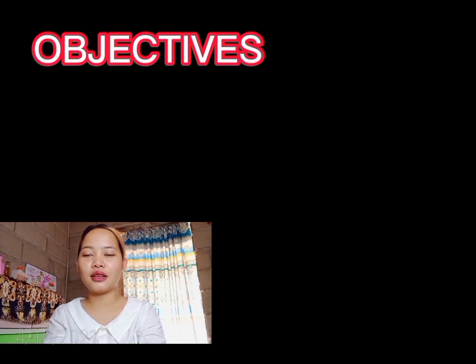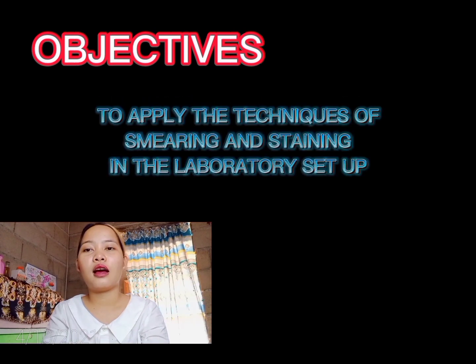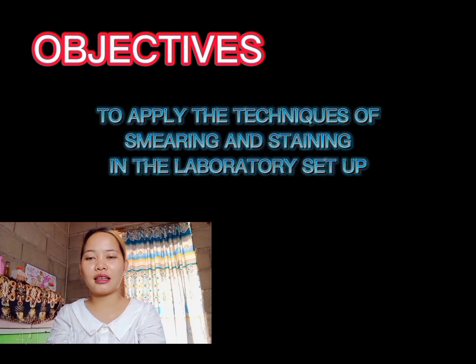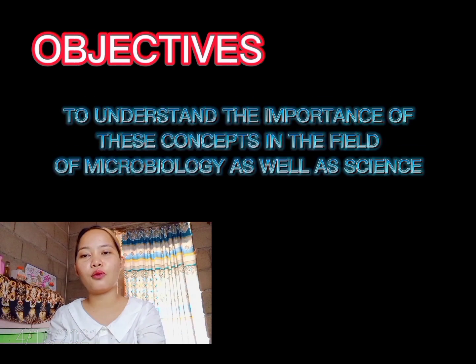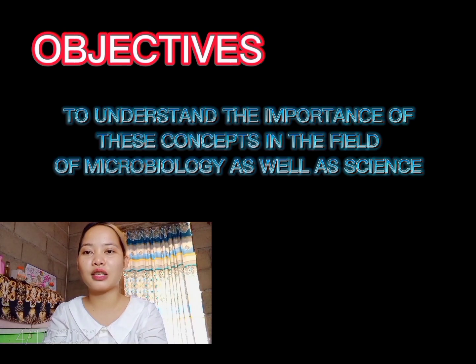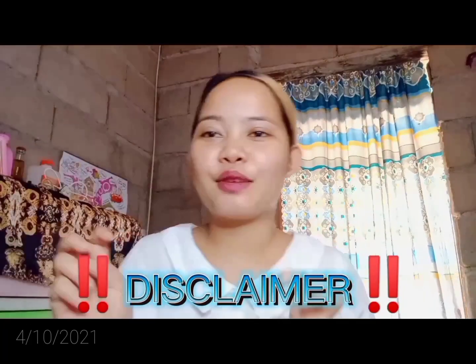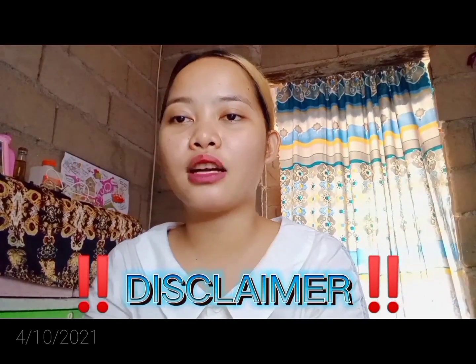The objectives of our lesson are: first, to analyze and comprehend the concepts of smearing and staining. Second, to apply the techniques of smearing and staining in the laboratory setup. Third and last, to understand the importance of these two concepts in the field of microbiology as well as science. Just a disclaimer, this video does not use full laboratory equipment or actual reagents.